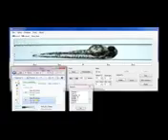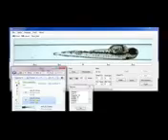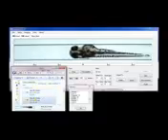How it works. The VAST system draws zebrafish from a sample source into a glass capillary positioned in front of a high-speed camera. Once triggered, the system automatically centers the larva in the camera's view. A 360-degree rotation is performed where it captures test images to orient the larva in the dorsal, lateral, or other custom orientation for still imaging and video capture from the onboard camera. The larva is then flushed from the system, allowing the next larva to be processed in a similar manner.